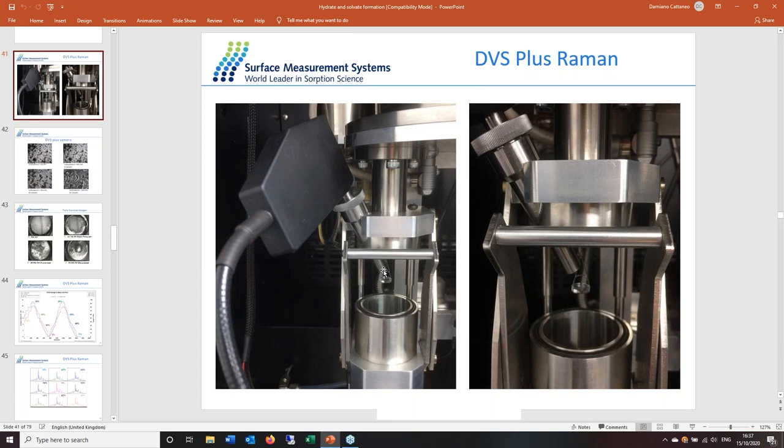Okay. Next, we have another question from Zaid Asif. How can we explain the hysteresis in the water uptake in the sample? From a thermodynamic perspective, if the sample is allowed to reach true equilibrium, the uptake should only depend on the state function, RH percentage. Right.